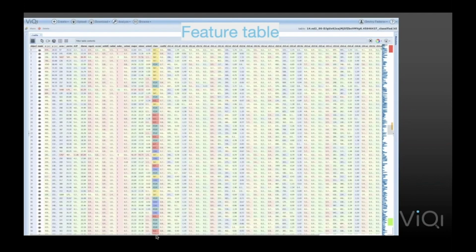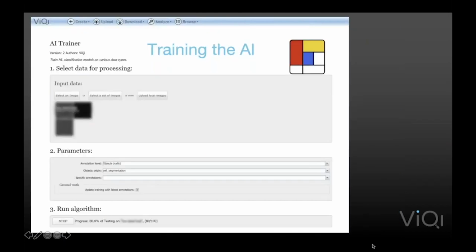So that's essentially what you're doing when you're training a feature-based AI. Of course, in deep learning, you would just feed it the pixel mask, and it would figure out all of this numerical content internally. So next, we'll look at, in our case, deep learning AIs are almost there for push button AI.